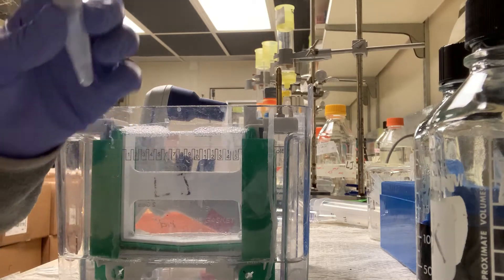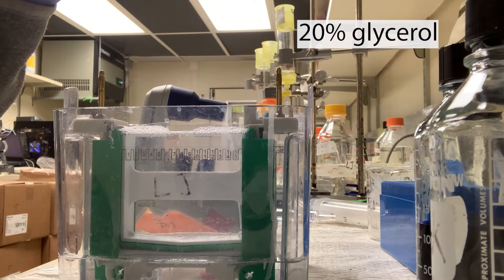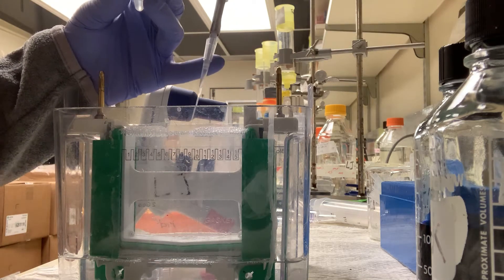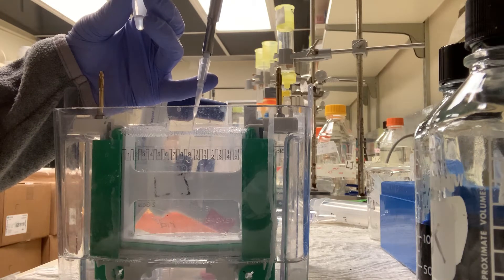I'm just going to fill the empty lanes with like a 25% glycerol solution so that it doesn't run wonky, because I only have eight samples and if you have a bunch of empty wells that's going to cause problems.